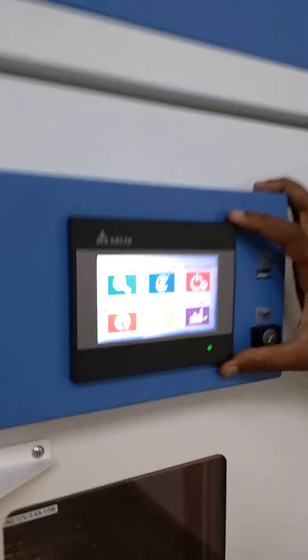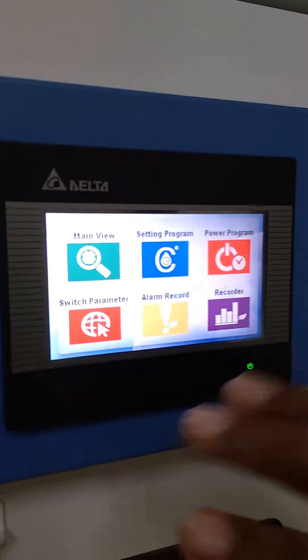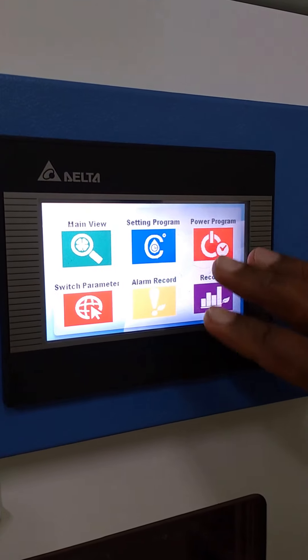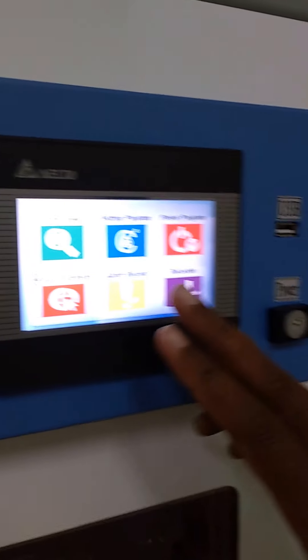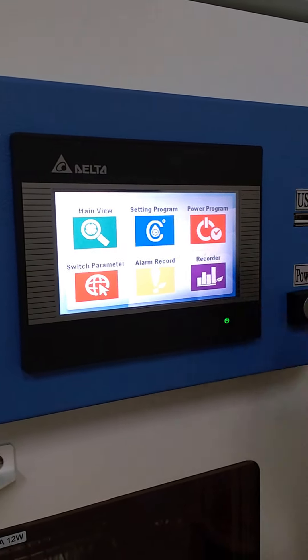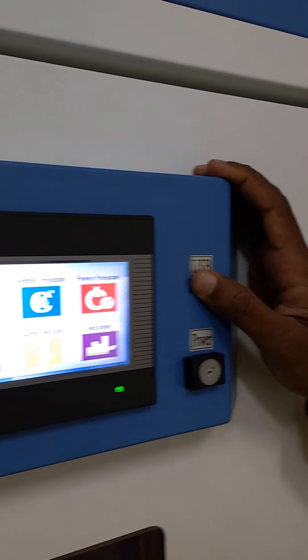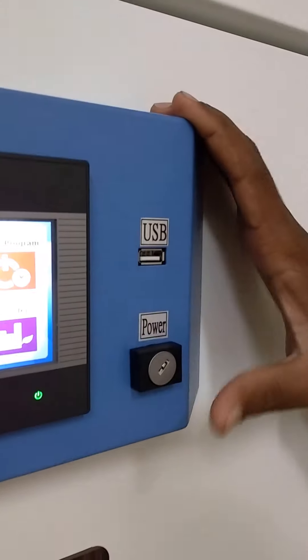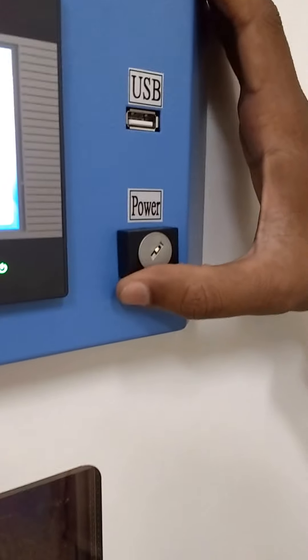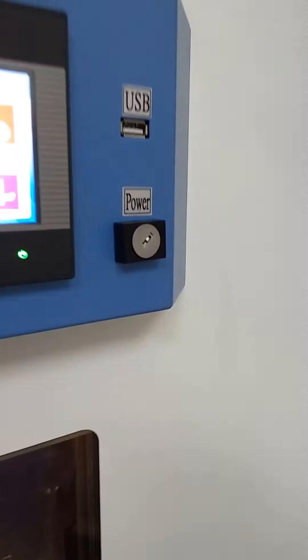All parameters can be set with these six apps: main view, setting program, power program, switch parameters, alarm record, and track. It has a USB port for data recording purposes and a power socket with a key mechanism.